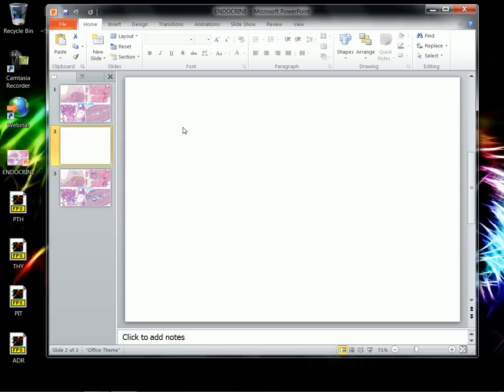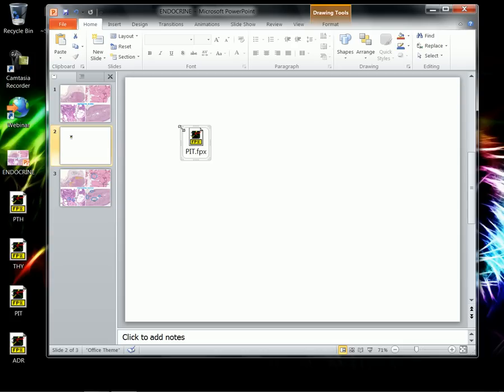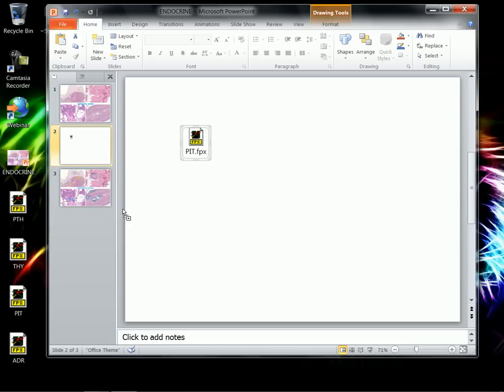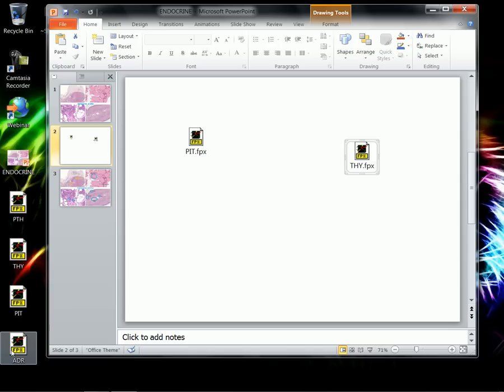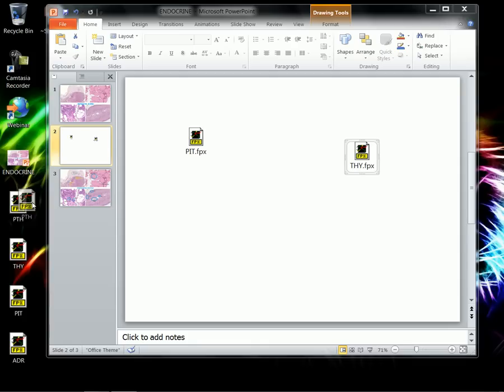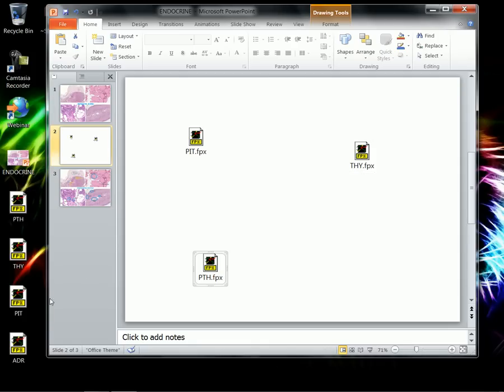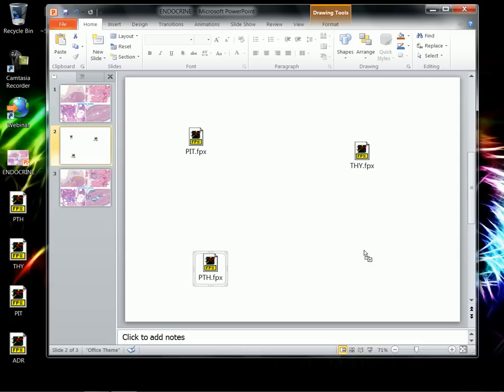I'm dragging another one called THY onto the same blank page. Now I'll drag a third one called PTH and put that somewhere on the blank page as well. And finally, I'll drag over something here called ADR.